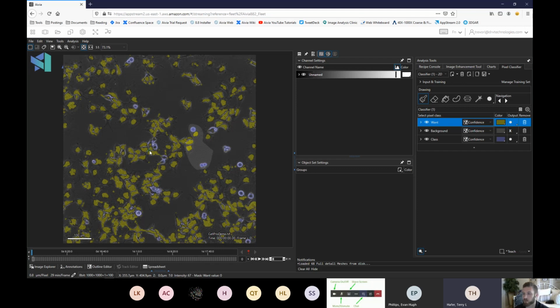Yeah. And note that your paintings for these have to be completely mutually exclusive. You can't have each pixel belong to more than one class, but whenever I apply this, I'm going to get separate channels of confidence or separate segmentations for each one, and those can overlap. So they're not completely mutually exclusive, or don't have to be.